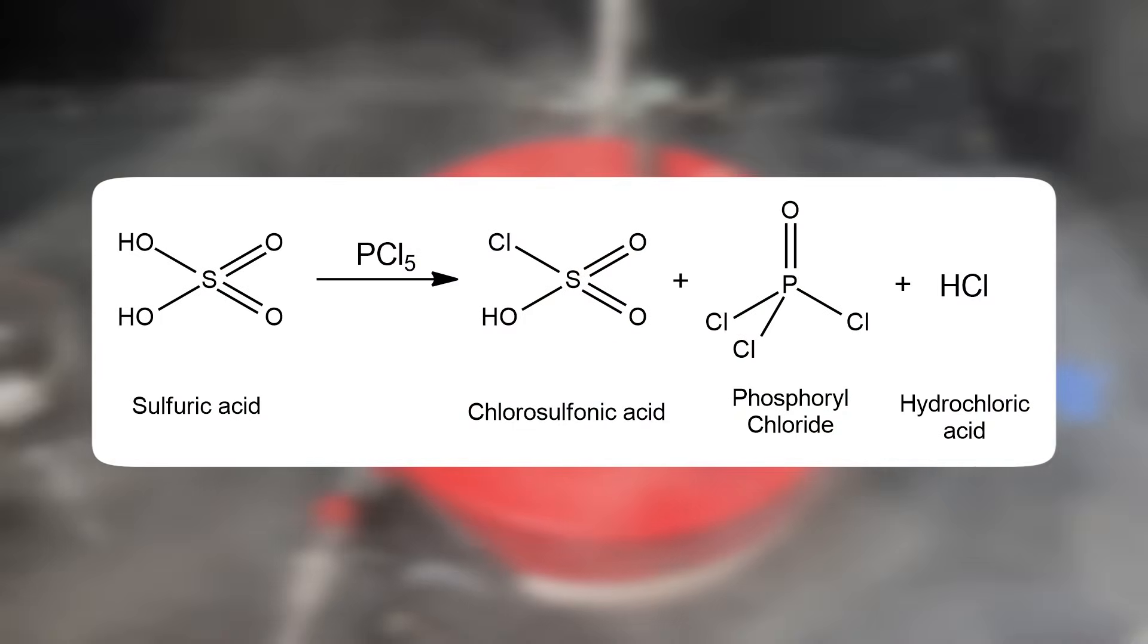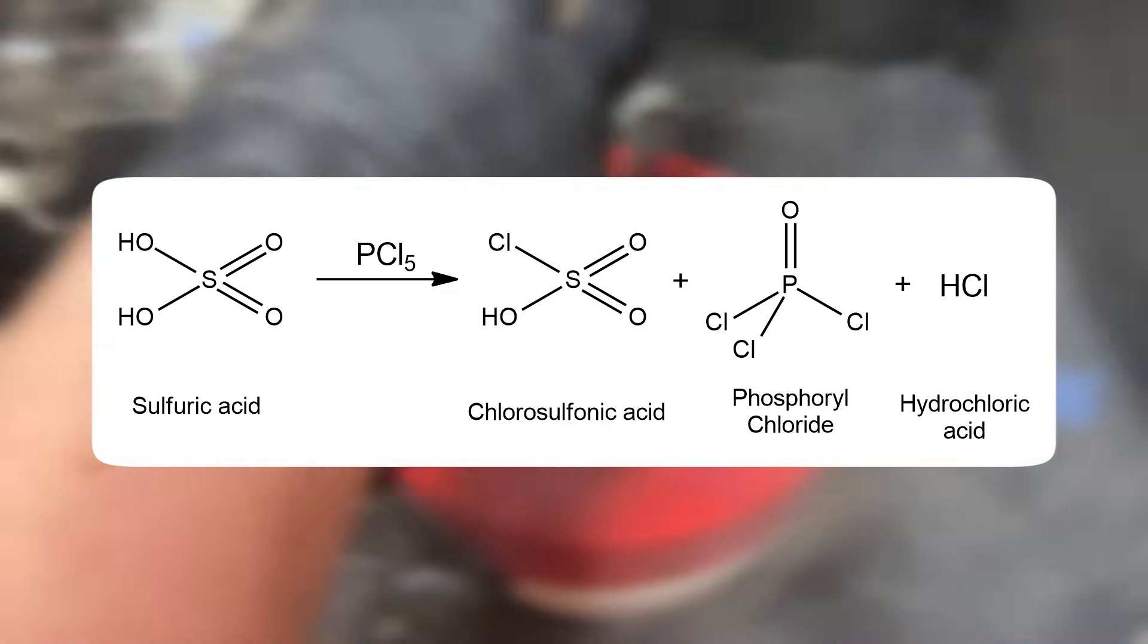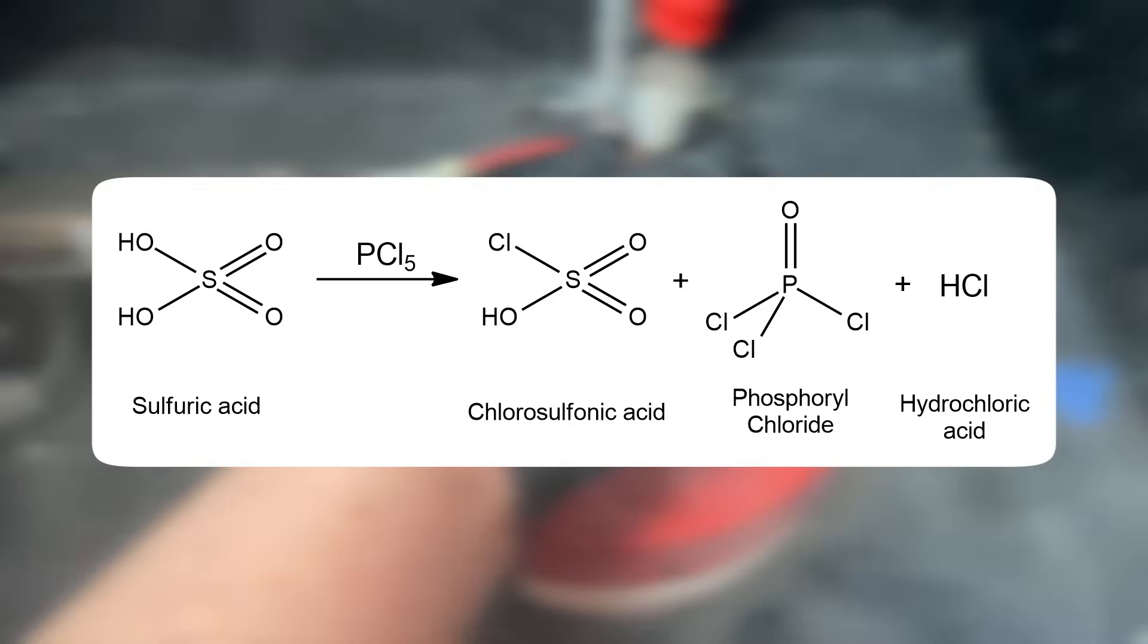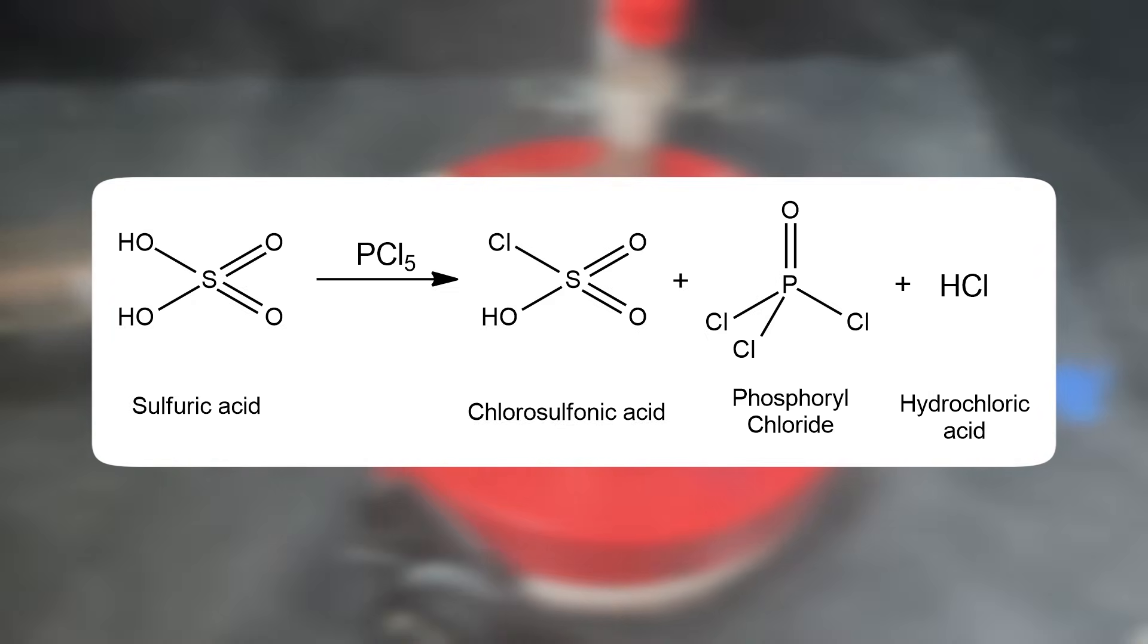Here, we're chlorinating the sulfuric acid molecule to form chlorosulfonic acid, hydrochloric acid, and phosphoryl chloride. Because HCl is a gas, it escapes into the atmosphere. And now we're left with a mixture of phosphoryl chloride and chlorosulfonic acid.